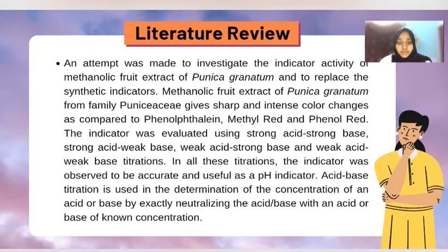The indicator was evaluated using strong acid, strong base; strong acid, weak base; and weak acid, weak base titrations. In all these titrations, it was observed that the indicator was accurate and useful as a pH indicator.